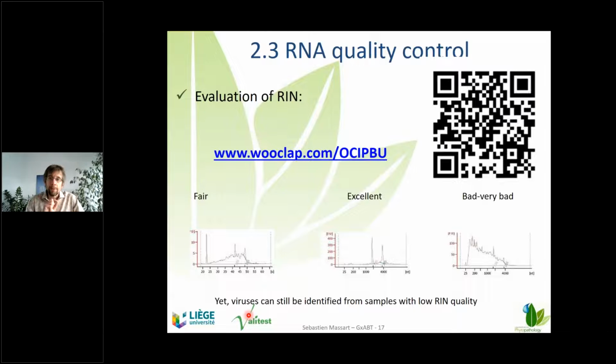Even if the sequencing facility provider tells you the RIN is too low, because they are used to RIN of 7 or 8 since they are doing transcriptomics with very fragile messenger RNA, here our viral RNA might resist better, and anyway, the viral RNA can still be detected.